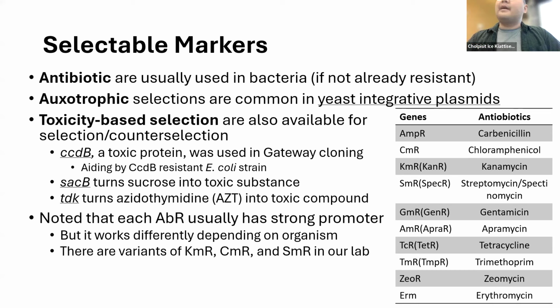These are the list of general antibiotics that were available, as I've seen in the SnapGene system at least. The list right here on the right are 10 of them, and the three counter selection methods or toxic systems listed there should be pretty common in the literature to some extent. So you can look further and search for these compounds.